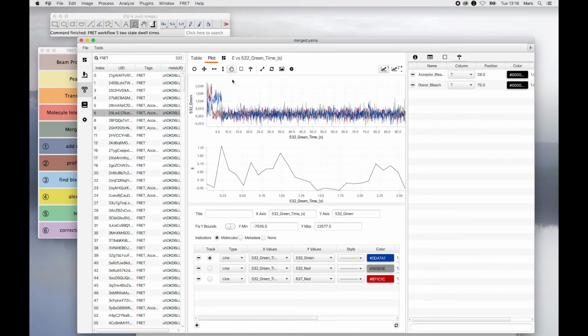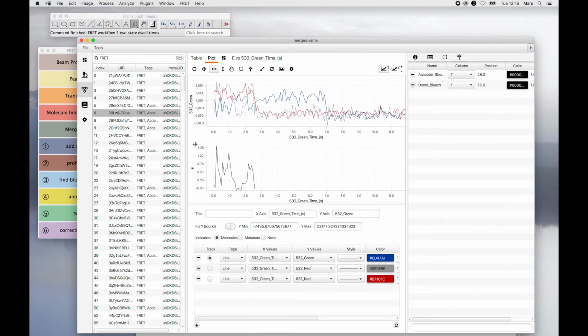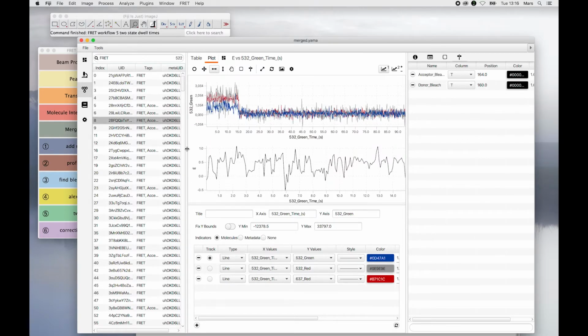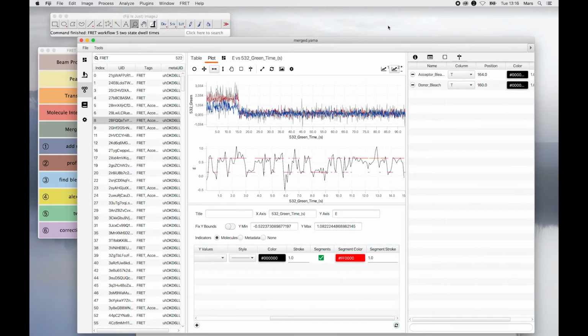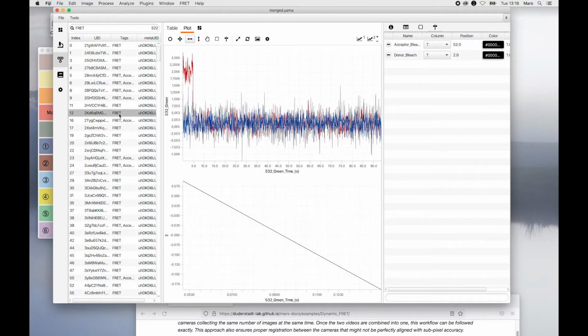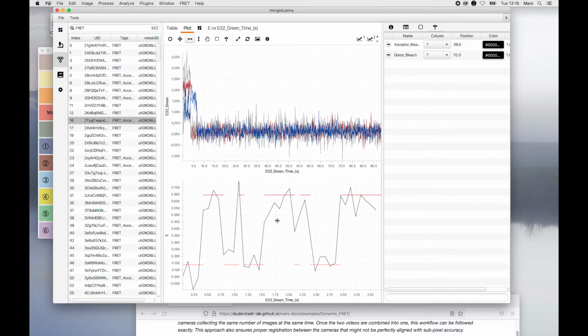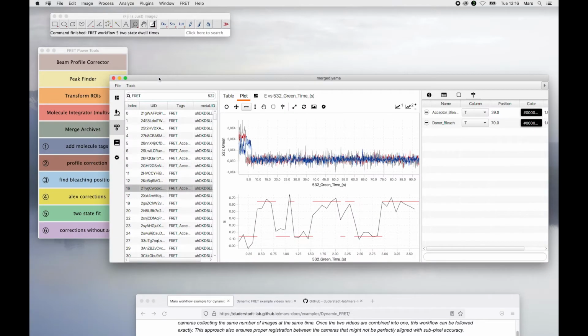And when you first open, they won't be aligned. But if you rescale, you can then see these transitions. And if we go ahead and add the segments that we calculated here, then we can see just with a very rudimentary two-state model how it's fitting these state transitions, as you can see here. All right, so that basically takes us all the way through phase 2.